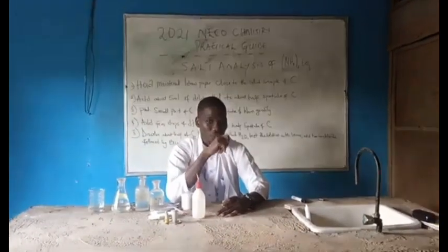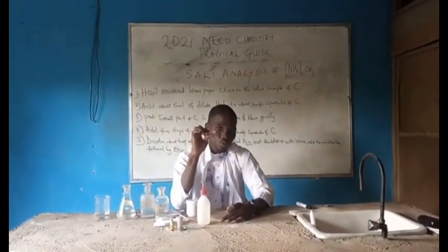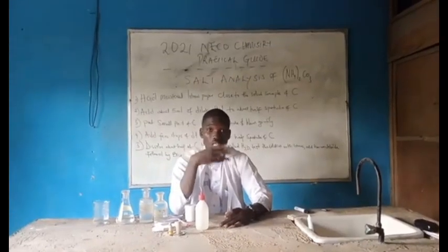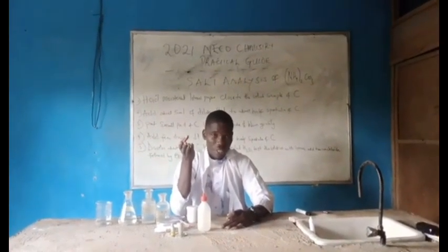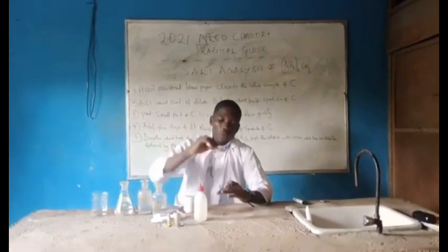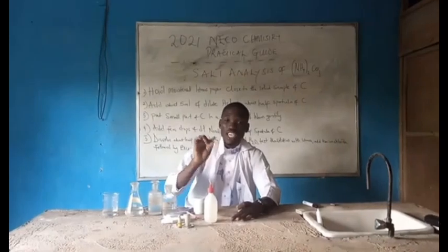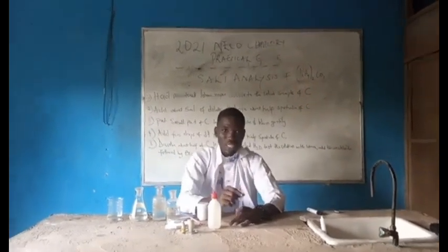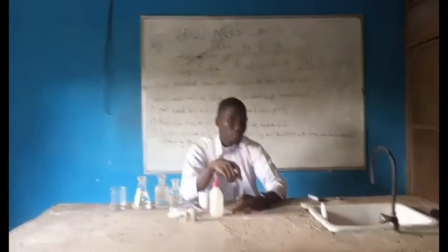And what is the inference? The inference is that from carbon dioxide, which is our CO2, and don't forget that our carbon dioxide is colorless, odorless. Are you with me now? So from carbon dioxide, the inference will now be from carbon dioxide to what? Carbonates. That is from CO2 to CO3 confirmed.